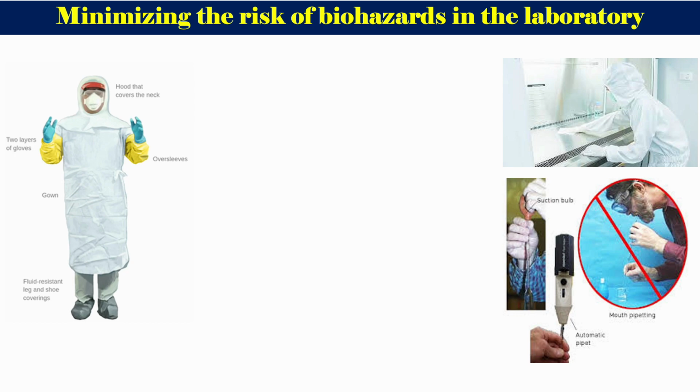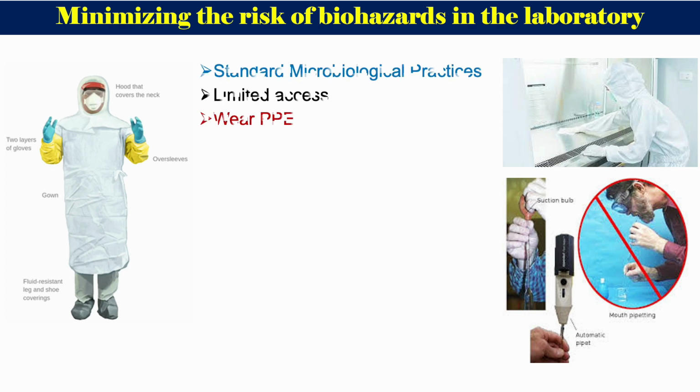So how to minimize the risk of biohazard in a particular laboratory? Before going into the details, please see the diagram. From the diagram, you will be able to understand how we can minimize the risks of biohazard in a particular laboratory. Still, we have to follow some important points to minimize the risk of biohazard.